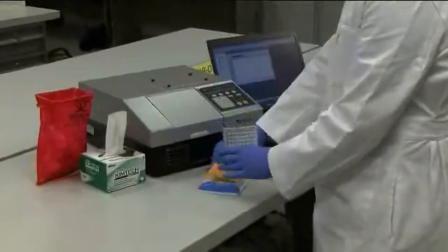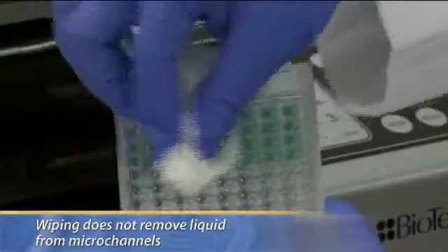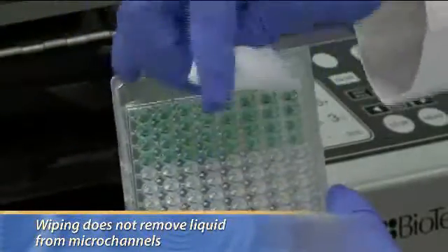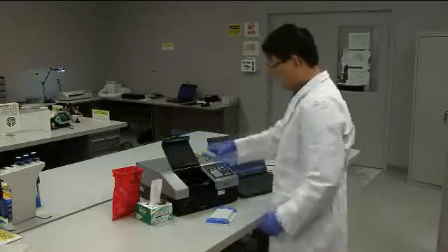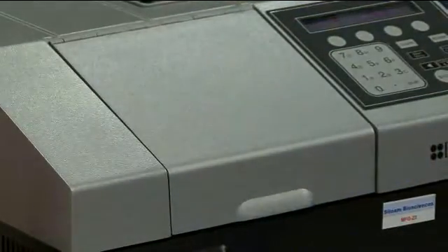After the assay sequence, remove the Optimizer plate from the holder and wipe the bottom of the plate to remove any liquid residues. Wiping does not remove liquid from the microchannels. The Optimizer can be read using any conventional fluorescence or multimode reader. And don't worry, the Optimizer will not leak any liquids into the reader.